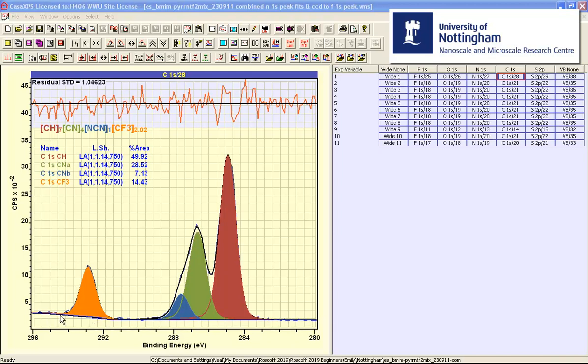So assuming that the only variation between two successive measurements would be the noise, then we can fit the same peak model to data collected at different times and observe how component peaks change in their fit as a result of simply changing the noise in the data.